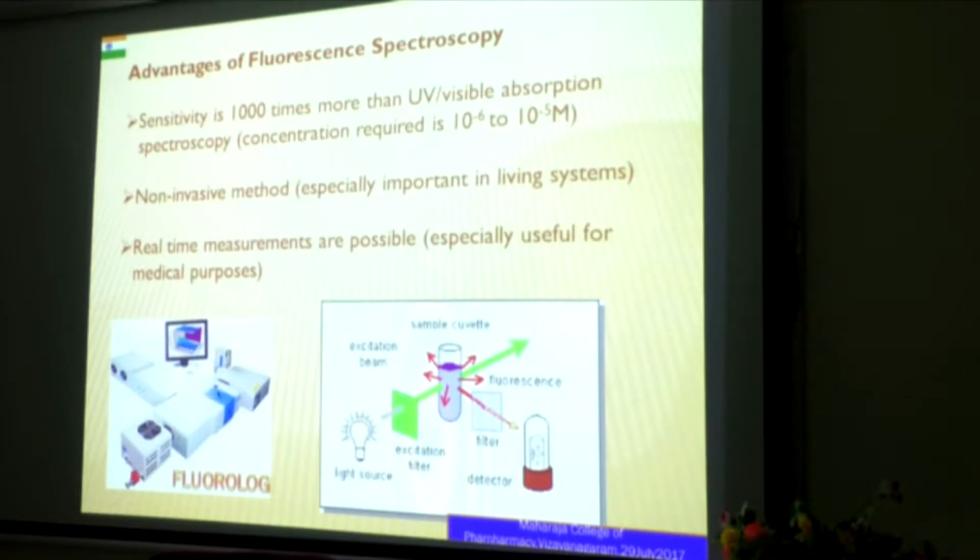If you run the fluorescence spectrum about 10 to 12 times, you will understand it completely, and you can easily graduate to operator level and pass. But interpretation is another thing, it requires a little more knowledge. You have to read various books, journals and other applications. For that you need more, and a constant urge is required.